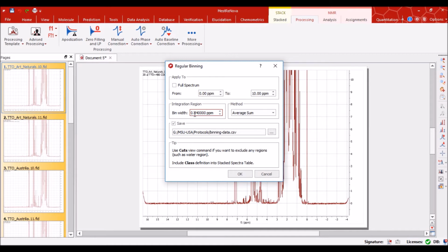This step is a post-processing step like other steps. It can be a very simple method, not even requiring alignment, to extract peak intensities for multiple NMR spectra prior to performing multivariate statistical analysis. It involves dividing spectra into small regions or spans of 0.04 ppm, which are sufficiently wide to include one or more spectral peaks, or can sometimes divide a big spectral peak. The intensity of each bin is determined by calculating the area under the curve.